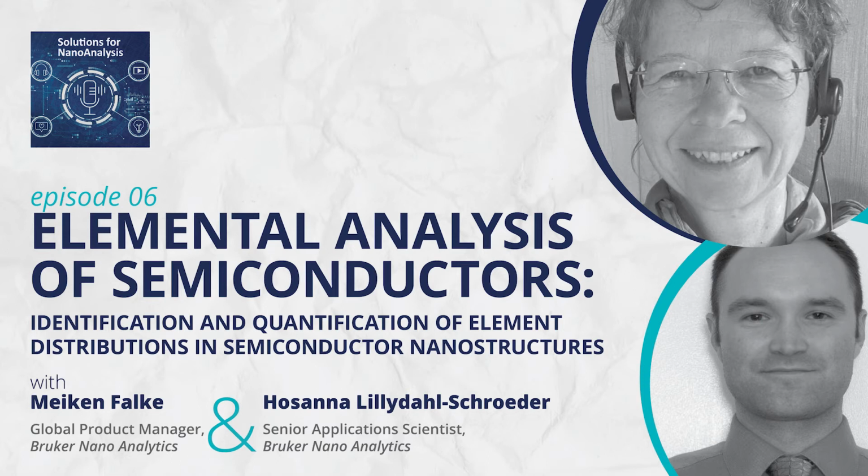And then there are particular elements which overlap or have so-called delayed edges, long range, broad edges, like the heavier elements used in 3-5 semiconductors. And this is quite uncomfortable to use for element ID and quantification.